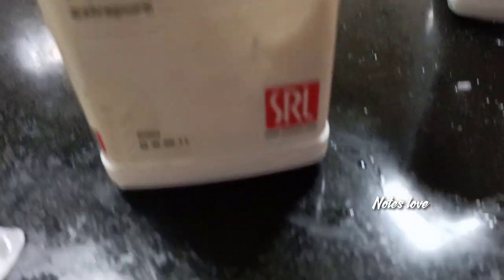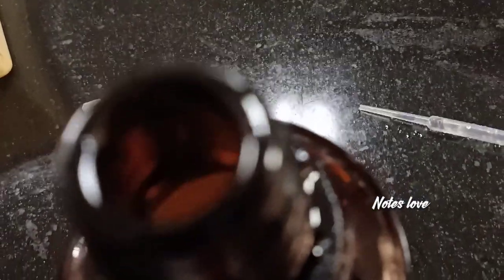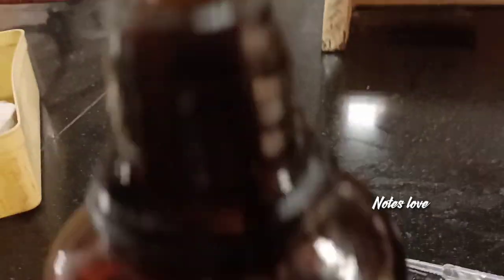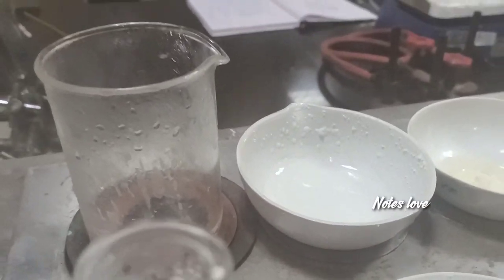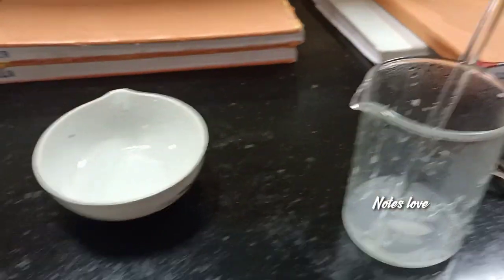Potassium hydroxide looks like this. Then we have glycerol, which is a viscous liquid. We transfer it into the china dish and the beaker. We need to heat it up to 70 degrees Celsius.